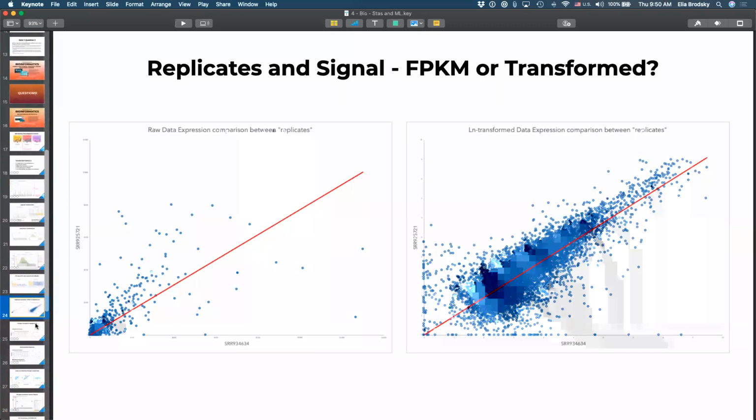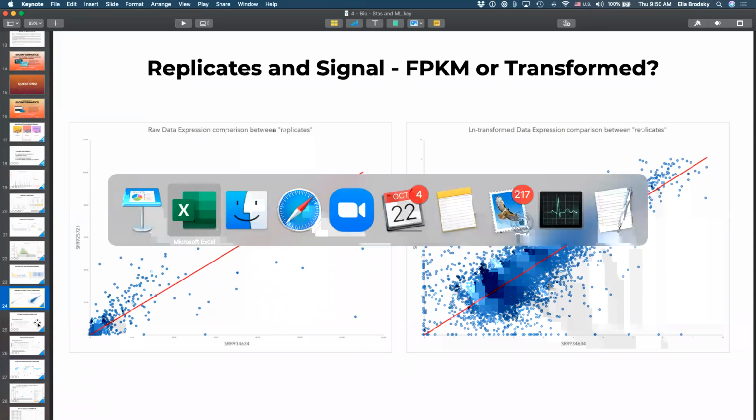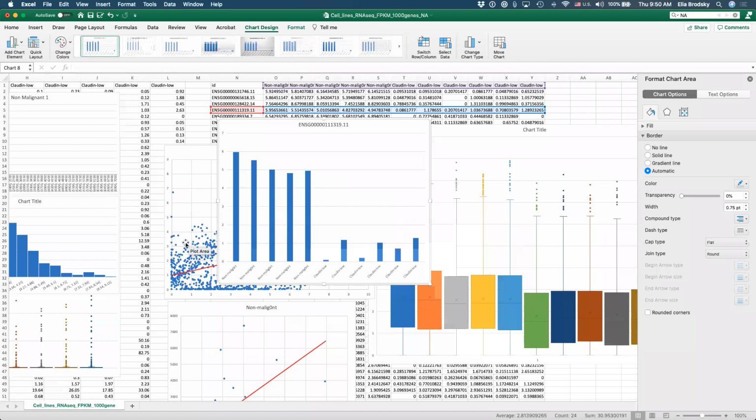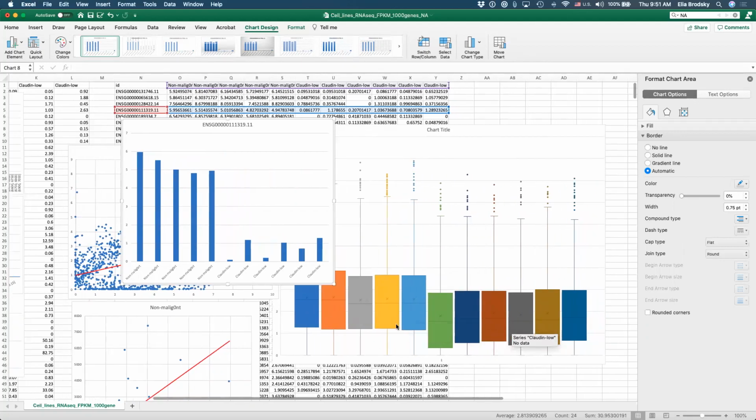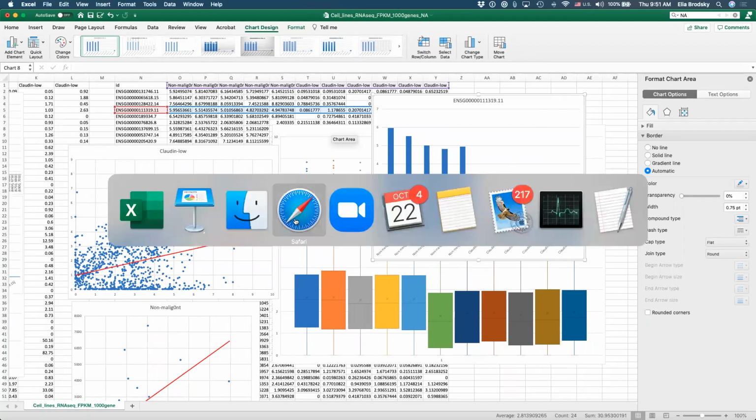So we've done some basic comparisons. Before we jump into individual genes, let's try to understand what all of this data together means about our samples overall. So we have here two groups, and overall we know that they're a little bit different, but how do we know that they're different in a comprehensive way? One of the ways to do that is to run a principal component analysis. So let's just see how to do all of these steps together.